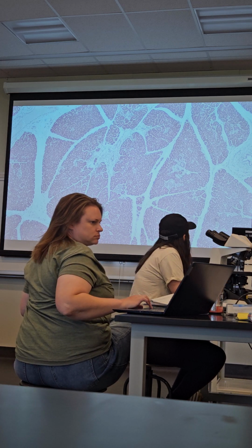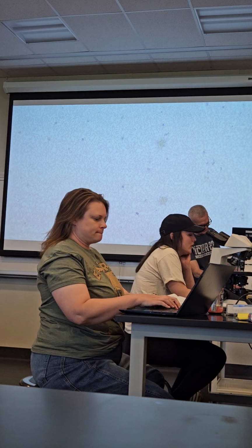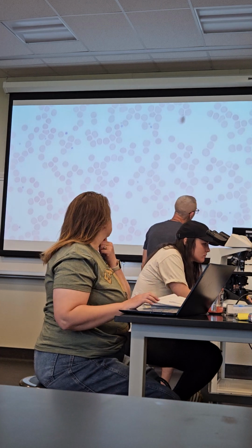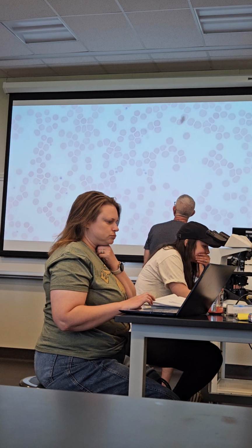Oh, and then the last slide, which you guys just did today. Blood. Yeah, blood. Just a real quick review of a few of those. There's all the red blood cells. All those purple specks are basically platelets, which are fragments of a megakaryocyte.